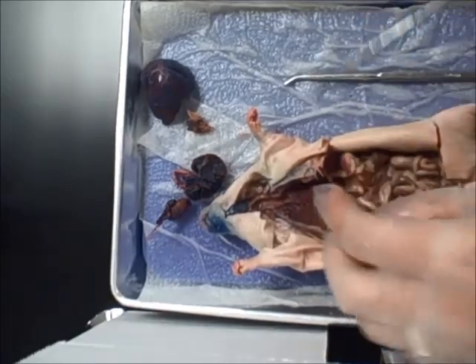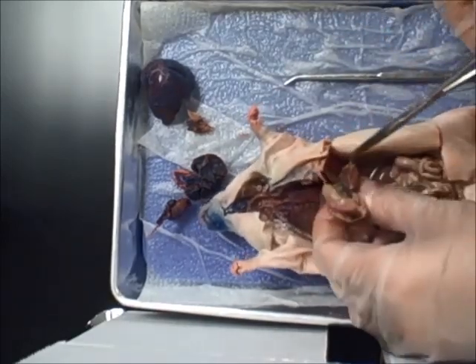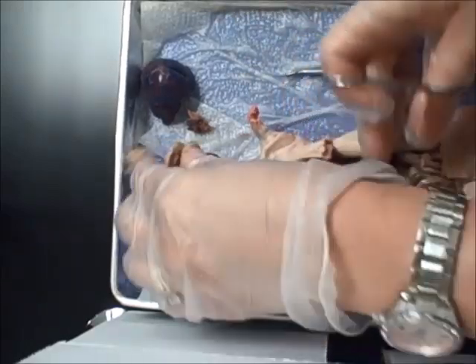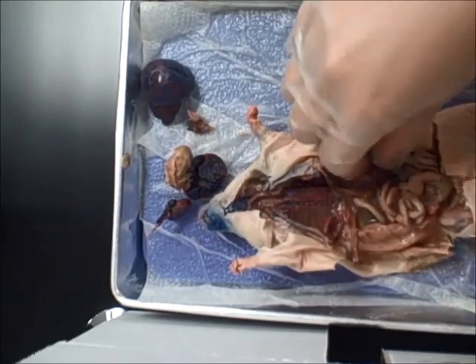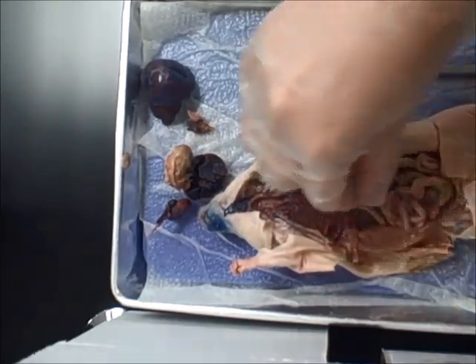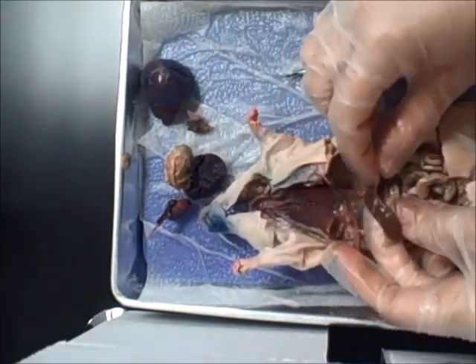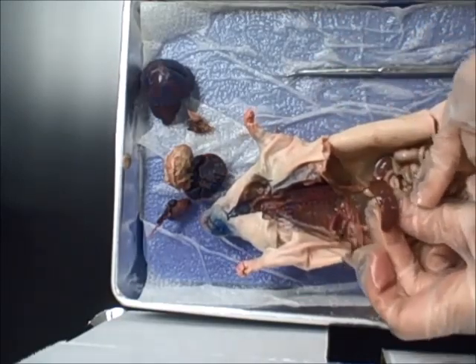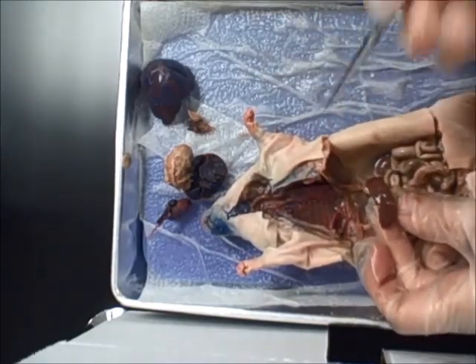The stomach leads down into the small intestine, which I'll show you in just a minute. Let me get the stomach out of the way. Just underneath the stomach we have the spleen. The spleen, to me, kind of looks like a brown tongue. Now, the spleen is down here by all the digestive organs. However, it's not a digestive organ itself.